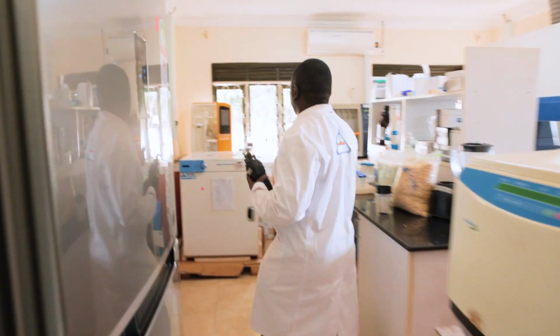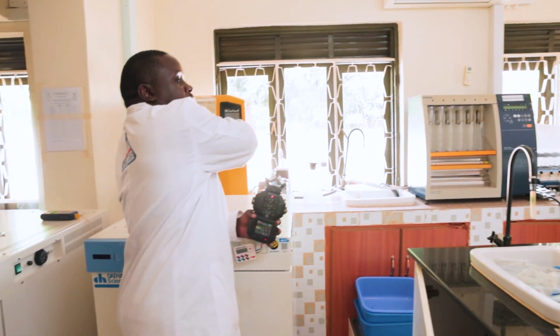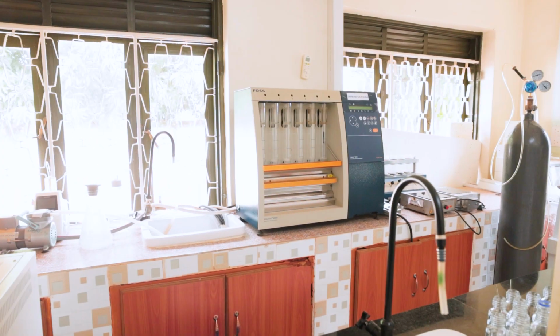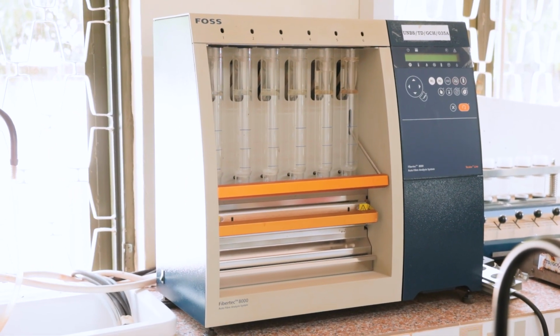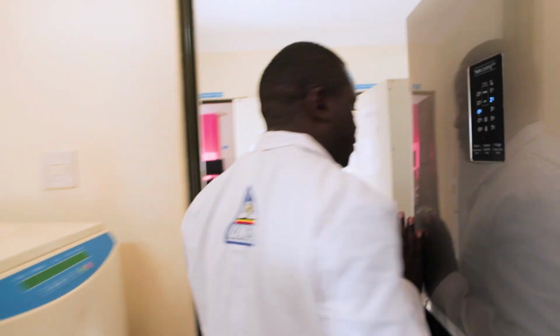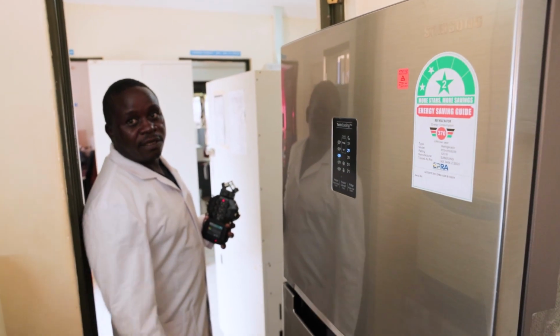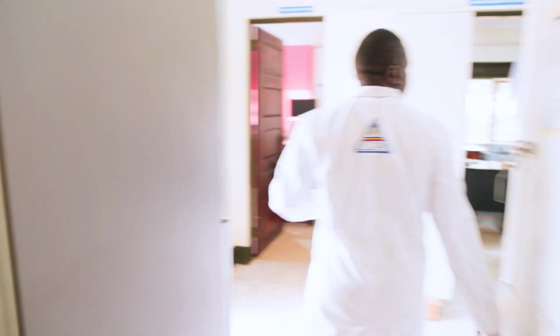And then we have other equipment. For example, this one is for protein analysis. The other one is for fiber. Then the fridges where we keep our standards and all that, control samples. This one.